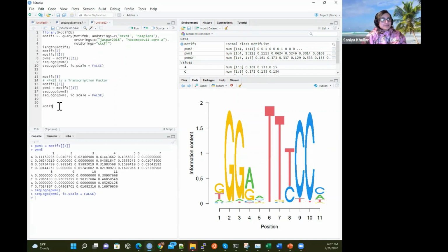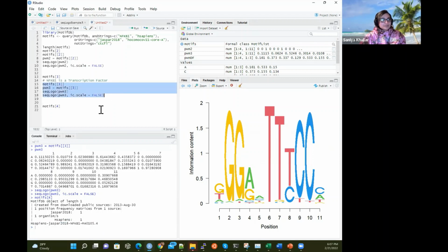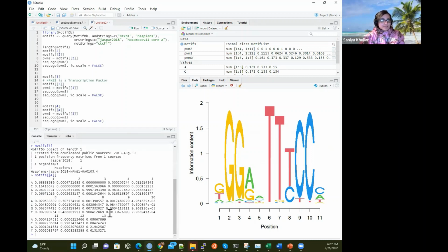And then lastly, we can also see motif 4, and this one will be .4 here. We can also just do the same here, where instead now this is 13. Before, the earlier two motifs were 11 bases. So this motif is 13, so it goes up to 13: the first position, second, third, fourth, fifth, all the positions. What is the probability of observing a given base, A, C, G, T, here? So it's going to be 13 bases long.